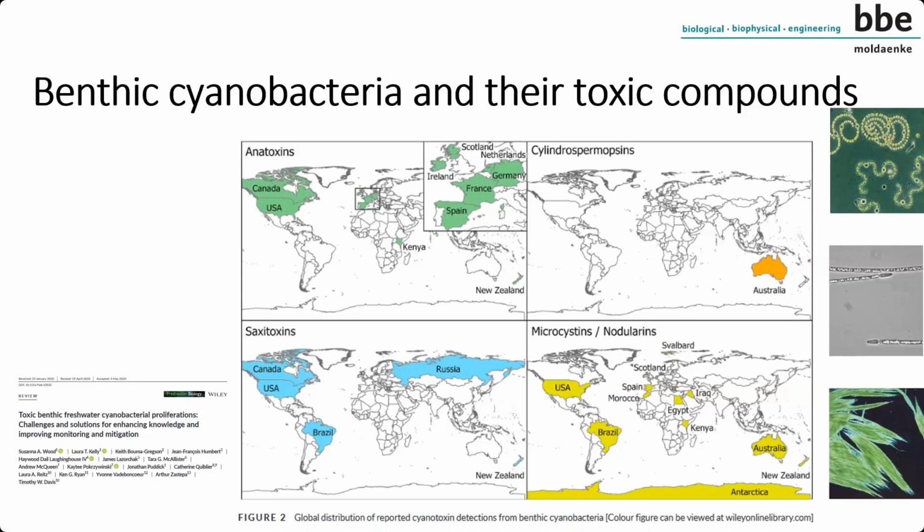Usually this is done in fresh water, in the pelagic water, that means in the free water as phytoplankton, but it is not that typical that the benthic algae are investigated. Unfortunately, these analyses for these biotoxins have to take place in the laboratory, and we use sophisticated instruments like HPLC, that means liquid chromatography, together with MS, and it takes time to bring this to the laboratory.